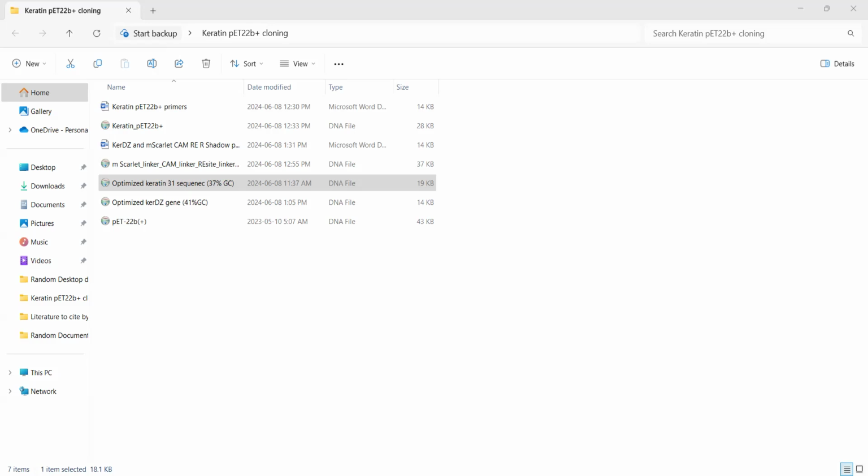Okay, so you do Control C, and then you go to reverse complement again. Okay, and let's see whether our extensions are fitting. Perfect. Okay, now these extensions, you copy them and you put them into your primer.